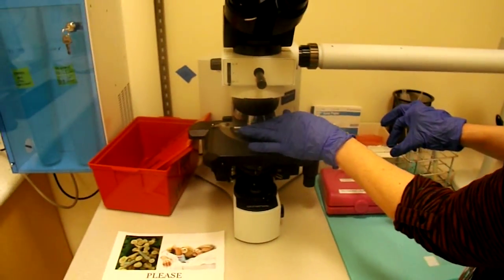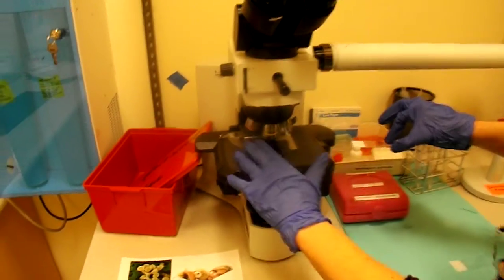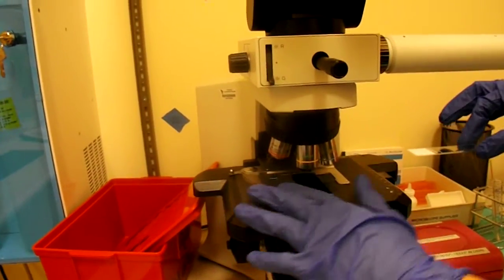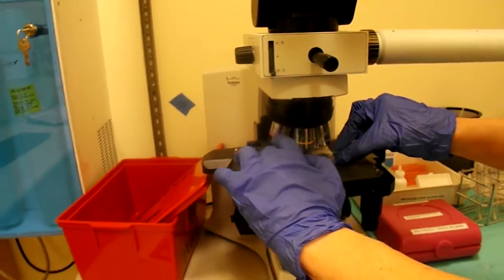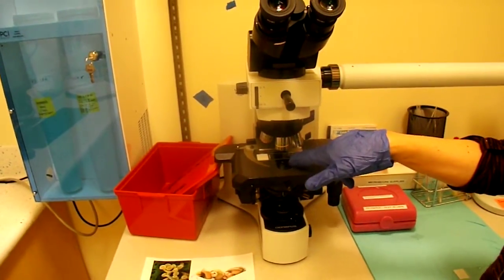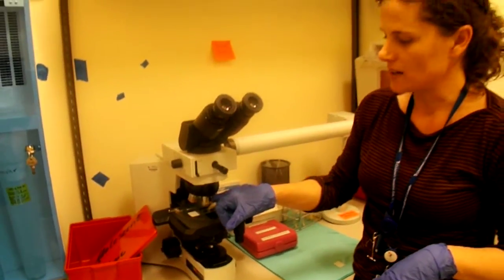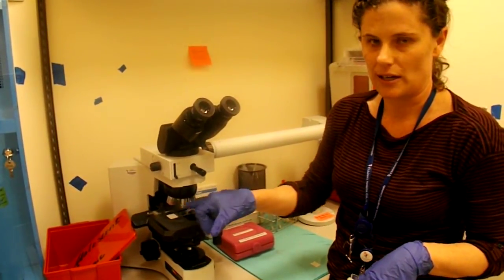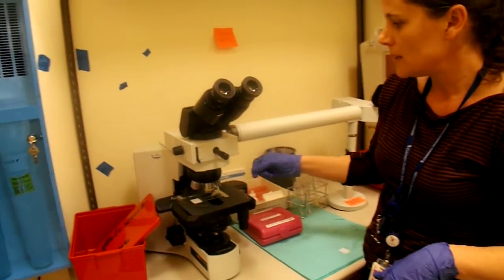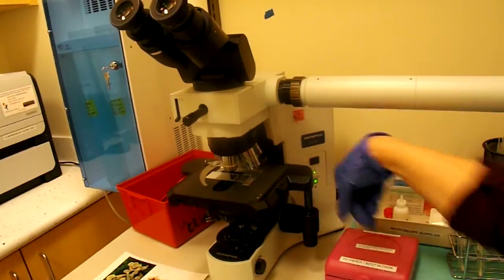When you go to the microscope, you're always going to start on pretty much the second lowest setting. I don't know what the actual magnification is, but it's the yellow one, and you put the slide under here. You always have to be very careful with your sample, especially when you're using the KOH. You do not want it to touch the lens itself, because that will dirty and mess up the lens, so be careful. The light is on this side. This is how you turn the microscope on.